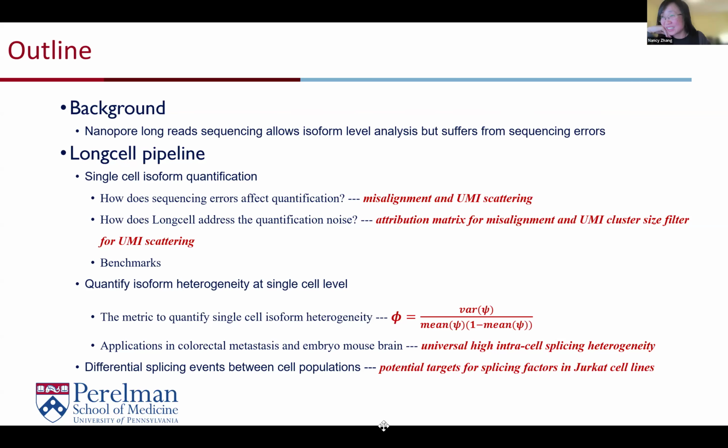So what I'm wondering is why. Did you try to explore what might be the biological mechanism or biological reasons, such as maybe different regulators causing different types of heterogeneity? Or do you think it could be, I think it's unlikely, some technical effects there? Maybe the sequence errors are biased towards some genes, some sequences, so that your algorithm is very sensitive at some genes, but less sensitive at other sequences, other genes.